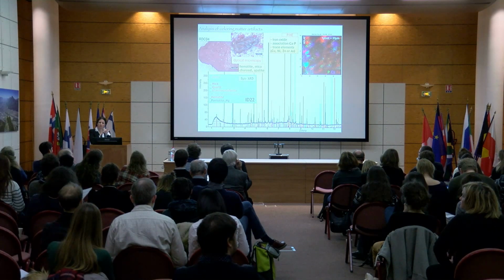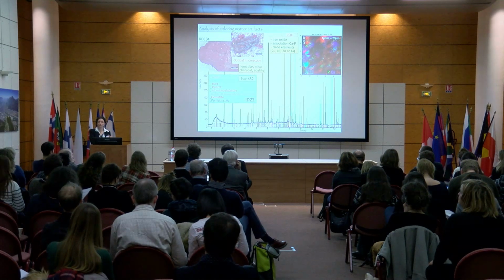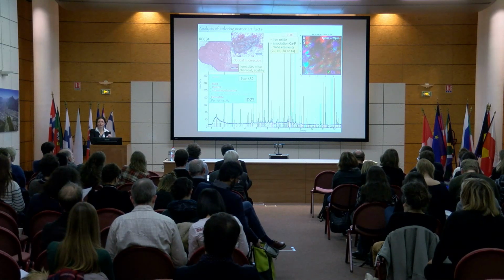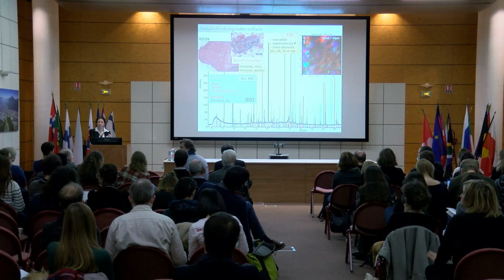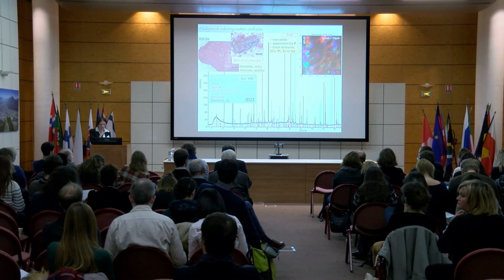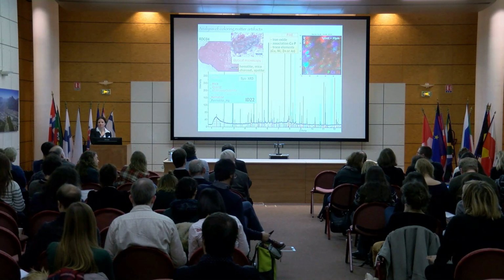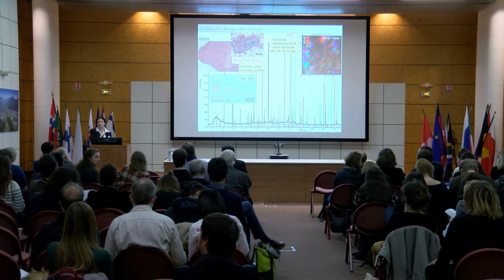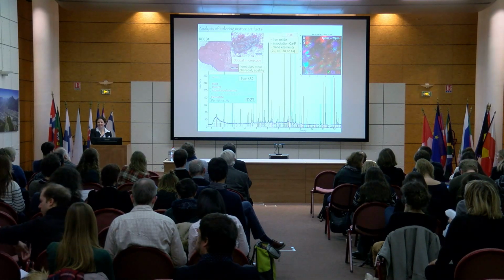So we see some natural crystals, but it seems there are 2 or 3 kinds of different apatite inside the sample. Yeah, but due to the morphology and the color, they are crystalline. Yeah, but in burnt bone, apatite is not necessarily crystallized. No, I know. Yeah. Okay.